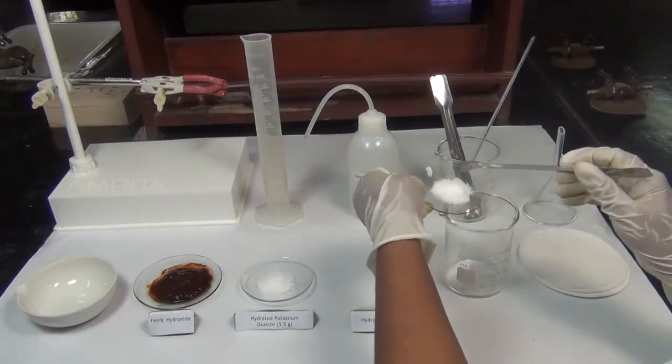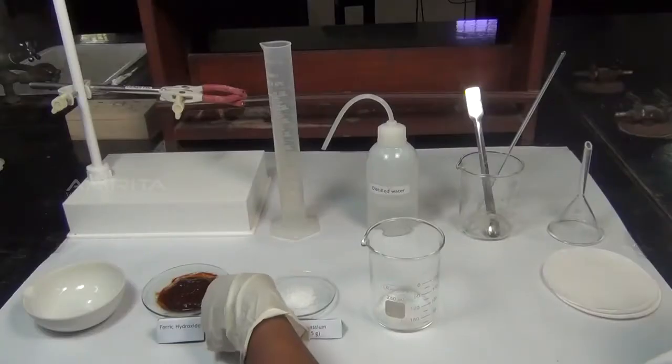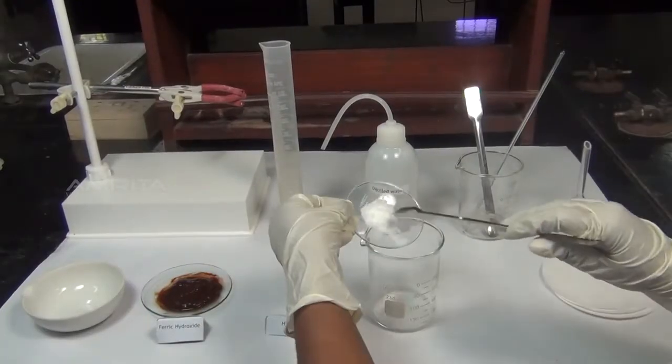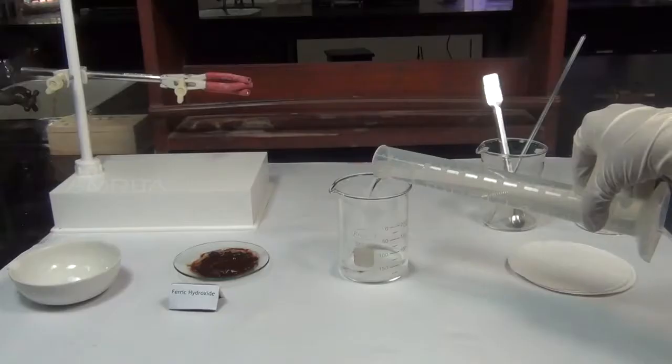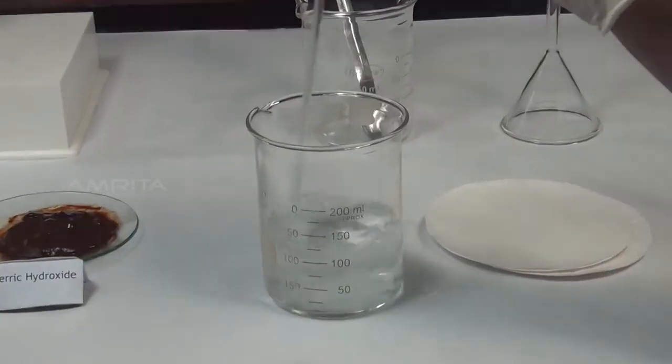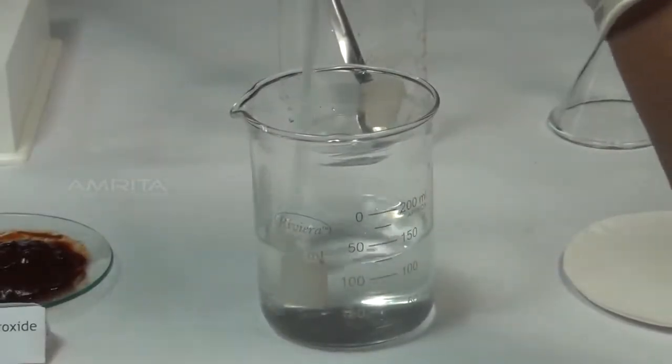In another beaker, take 4 g of hydrated oxalic acid and 5.5 g of hydrated potassium oxalate. To this add about 100 ml of distilled water. Stir the solution thoroughly using a glass rod to get a clear solution.